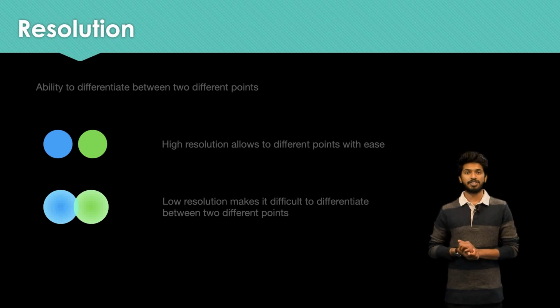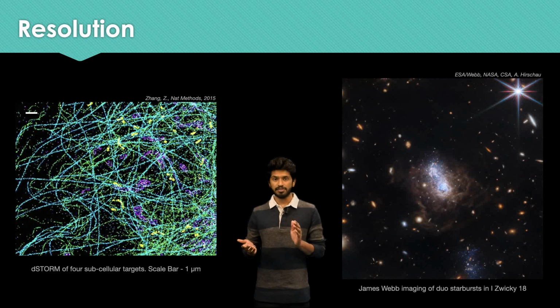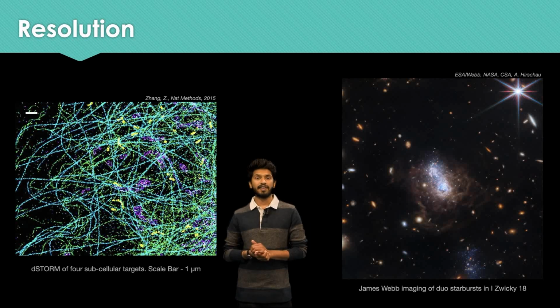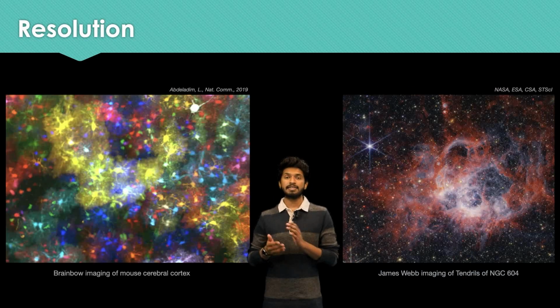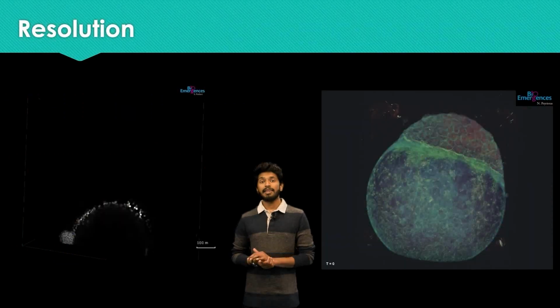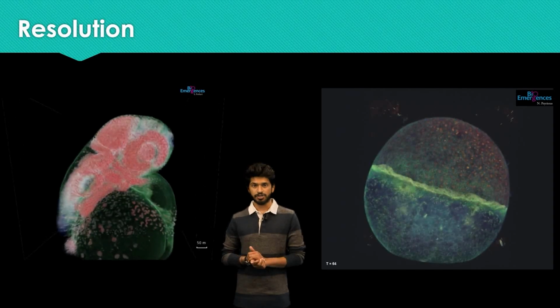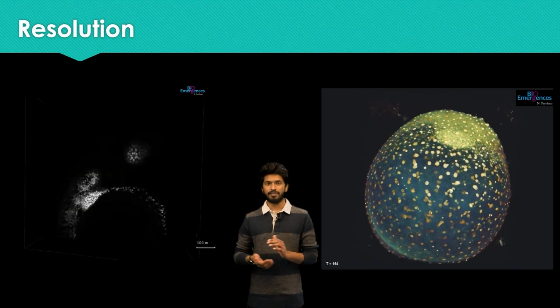So the first thing we need to understand is why do we need high-resolution imaging? High-resolution imaging is a technique used in different fields like biology and cosmology to understand and observe different events that are unable to be observed by the naked eye, either because these events are at too small of a scale, or if the events are too far away to observe. In this MOOC course, I will be talking more about the biological aspect of high-resolution imaging, as that is what we do in our lab, and the different methods we use to observe this.